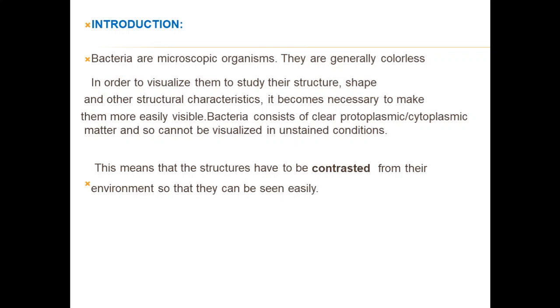So if we have to study the shape and the arrangement of these microorganisms, it is always necessary that we develop a contrast between them and their surrounding environment so that we can observe them easily. So what do we do to visualize these microorganisms? We carry out a technique called the staining technique, generally to develop a contrast and observe them under the microscope.